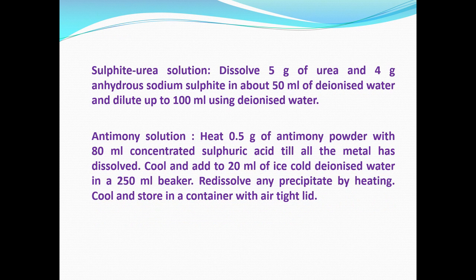I think most of you are aware that concentrated sulfuric acid, you should be very careful in handling, and it is a very highly corrosive liquid, and it is part of the hazardous nature of the chemical laboratory that if you want to determine nitrate spectrophotometrically you have to live with the fact that you have to use concentrated sulfuric acid with all the associated precautions. Okay.